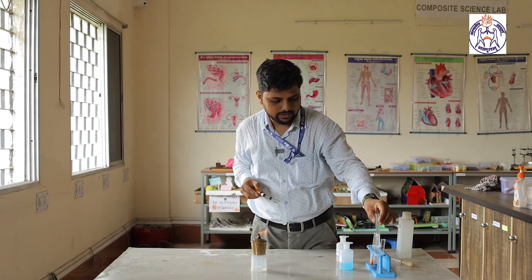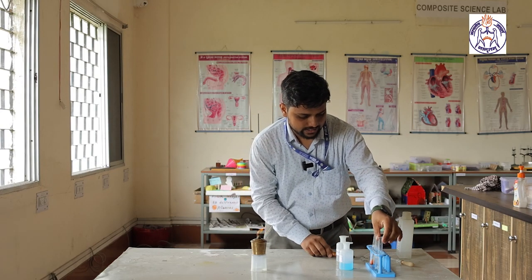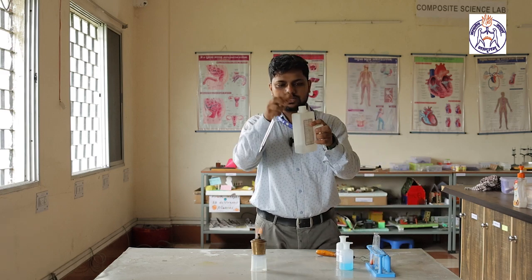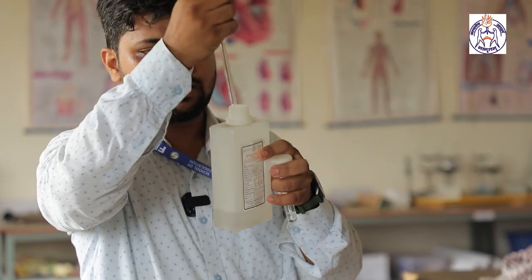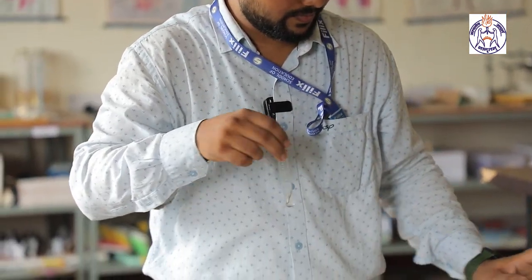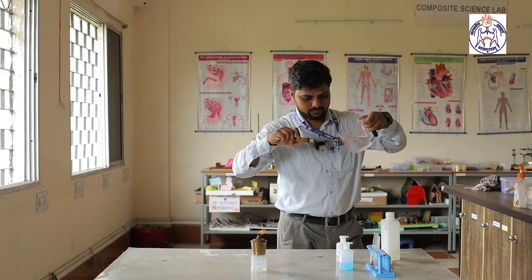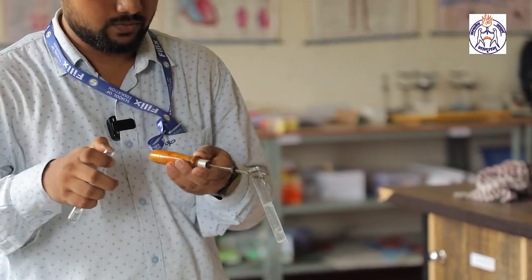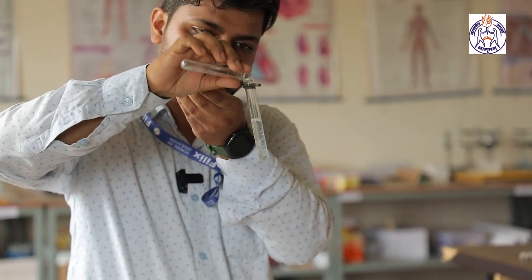The same experiment, if we do with water, we will see there is no change. So here we take water and then in the water we are adding a very little amount of ethanol. Then we will wait for a few seconds. We will see the coagulation reaction will not occur.